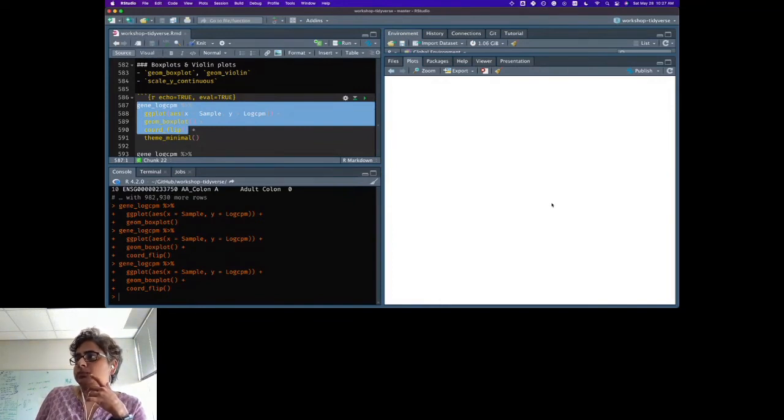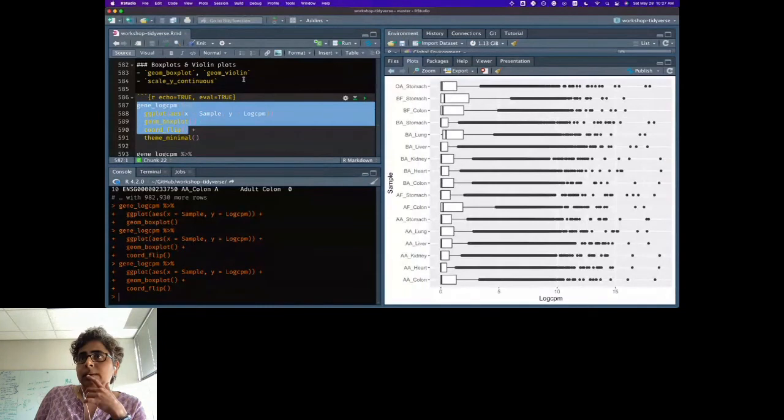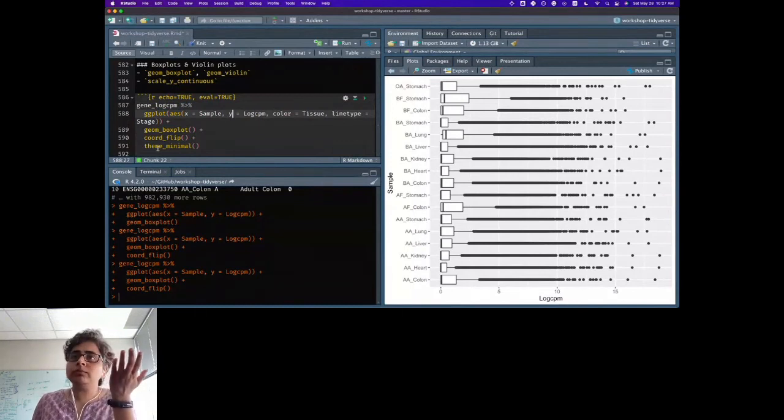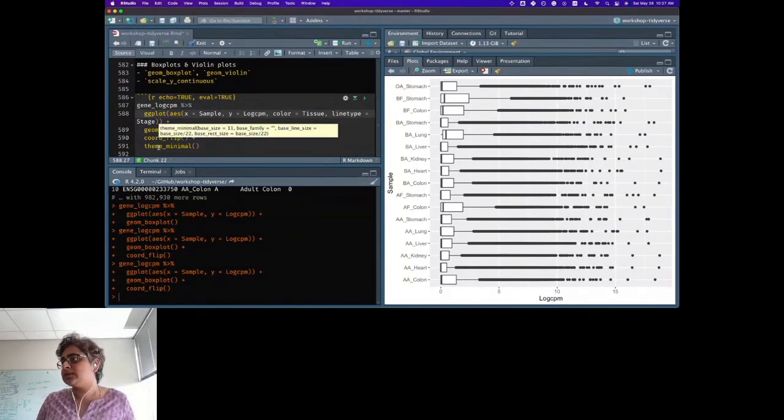Okay. But now I want to go back and add this. Well, you know very well what theme minimal does.